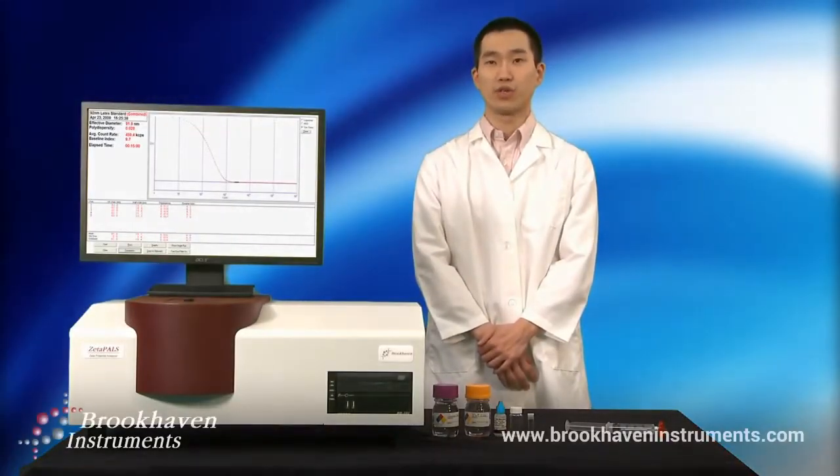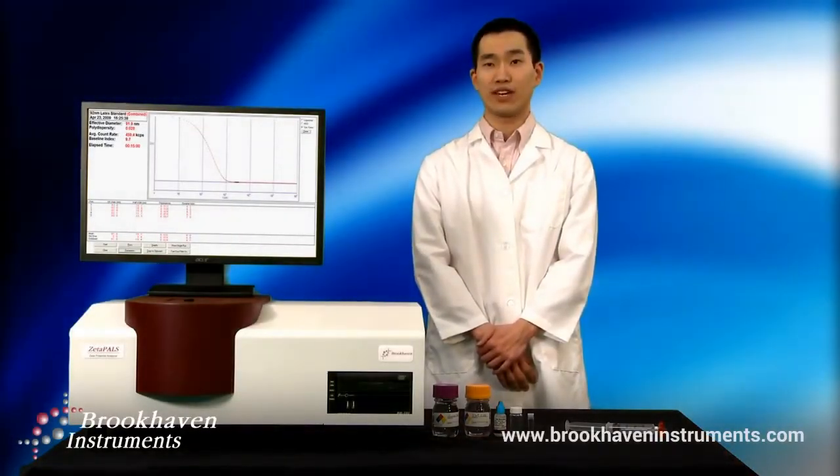Hi, my name is Zach and I will show you step-by-step how to properly prepare a latex sample for validation of DLS instruments. There are many different types of contaminants that can ruin sample preparation, but I will focus on the most troublesome, our invisible enemy: dust.